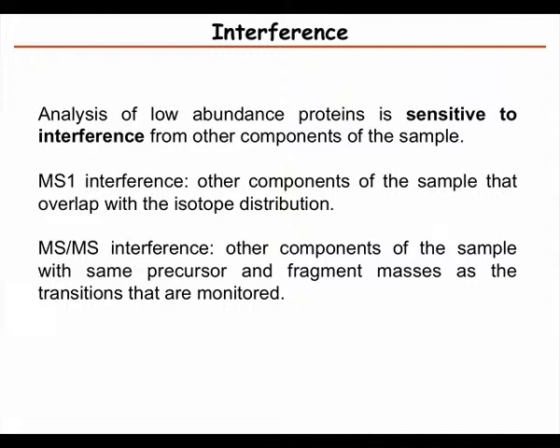So I mentioned interference before, and the main thing is that, especially if you look at low abundance proteins, the chance for interference is high.